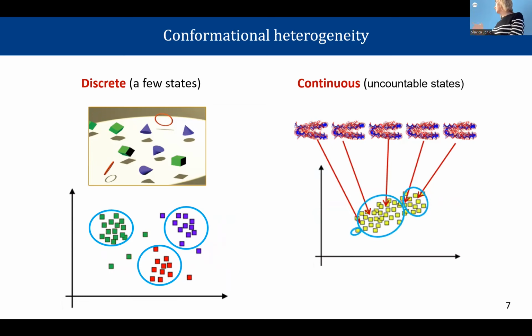So now the question is, let's say that you get this conformational space, and you use discrete classification methods. If this is the reality, this is your sample, and you have a spread of different conformations in this space, the classical approach is to say, okay, I want 3 classes, so how to split this space into three classes?